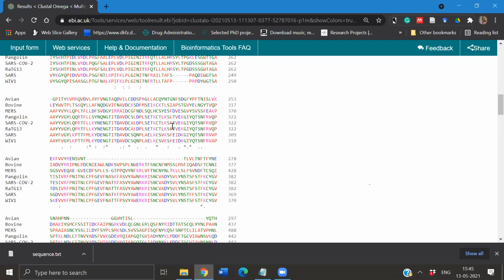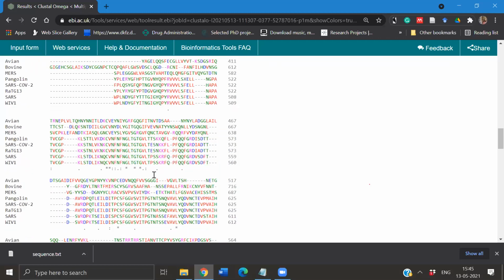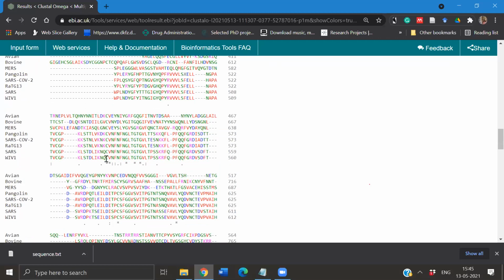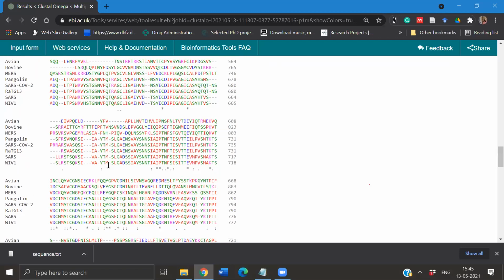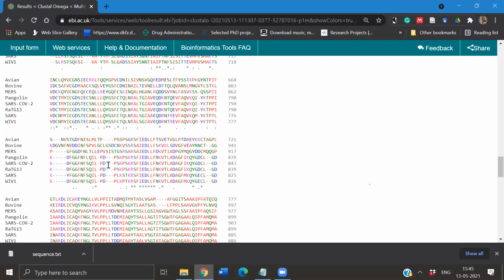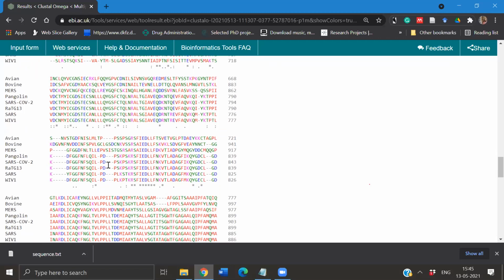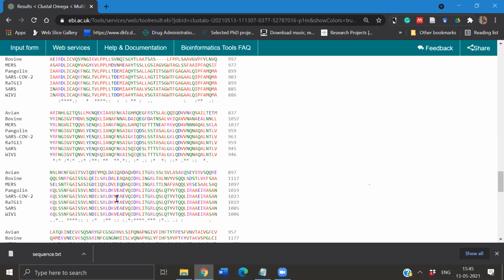Now, if you are to design primers, then having such sequences which are highly conserved won't work if you want very specific primers. But these regions will help you understand the infectivity, if you are studying the role of mutations or the role of evolution in the infectivity of the virus. Then these conserved sequences will be really very helpful.